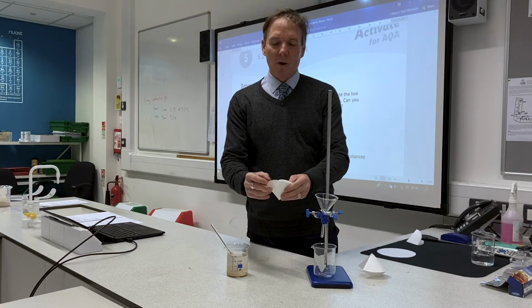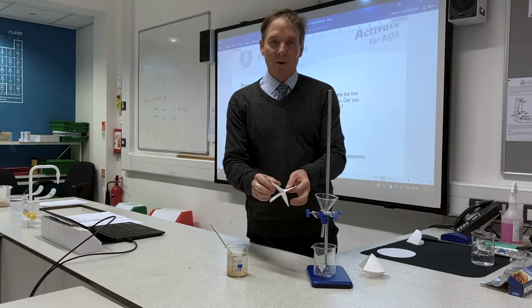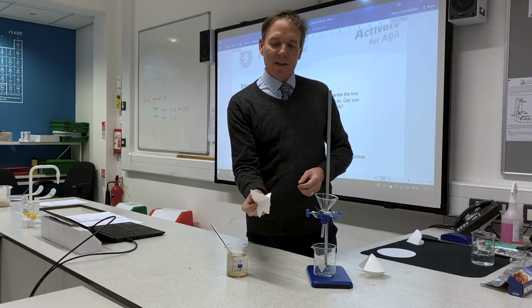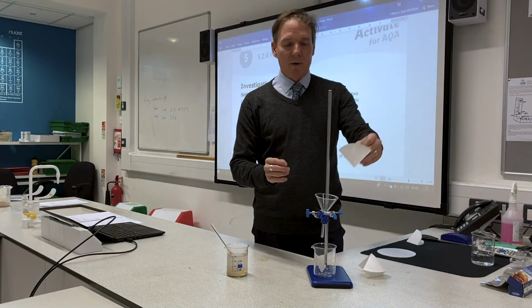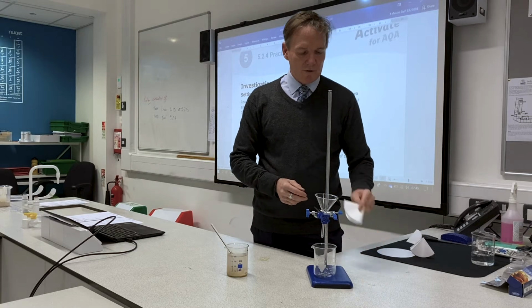You just carry on folding, and you can see it's got a nice fluted shape. You can fold it even more than that. And the reason scientists and chemists do this is to make the filtration a bit quicker. Sorry, we're not going to use the fluted filter paper today.